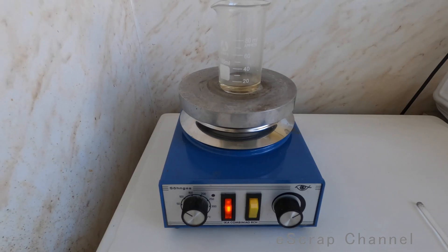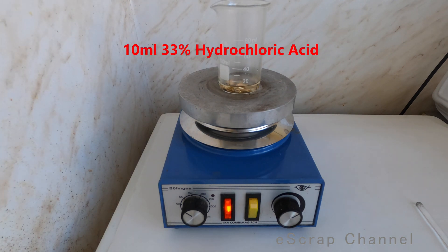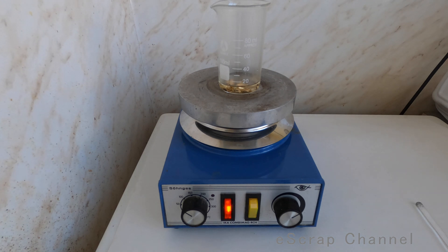Now we are in the lab and what we need is to dissolve our scrap jewelry. Let's put them in hydrochloric acid — this is hydrochloric or muriatic acid, about 33–35%. When I put the metal inside, this is supposed to be nine-carat gold, of course nothing happens. I started heating at about 100 degrees and I will start to slowly add nitric acid now. Let's see if this will dissolve the gold.